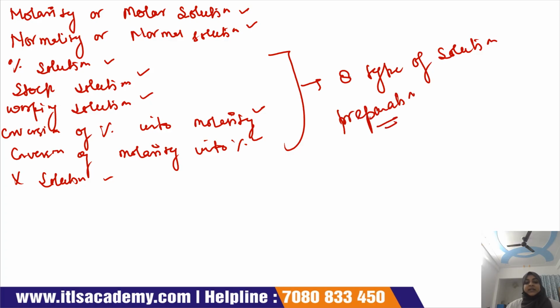The first one that we are going to discuss is the molar solution. Now we all know that this molar solution is the most common type of solution.